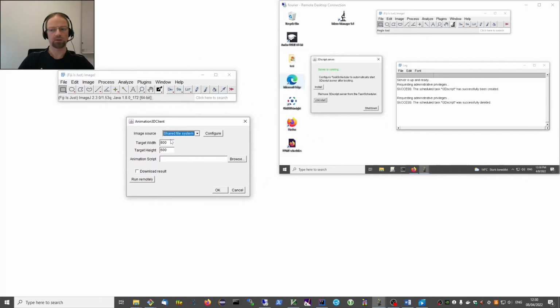And now before we start, one word about the input dataset. Of course, somehow we need to tell the server which image data it should render. And also the server needs access to it. So we could directly copy the data from the client to the server. But just imagine for a moment the situation like you're sitting at home on your laptop connected over a wireless connection, and you want to upload a huge data set, so that's probably not very convenient. Or maybe even think you're sitting in a cafe, you're connected over a metered network, and you don't want to upload basically a huge file.